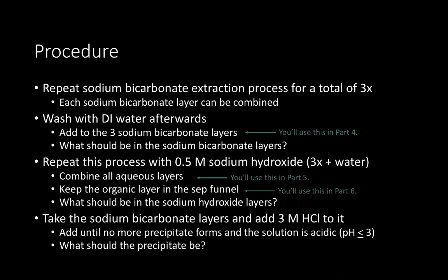At this point, think about what could possibly have been isolated in the sodium bicarbonate extraction. You're going to repeat the extraction process again, this time with 0.5 molar sodium hydroxide. Wash three times with the 0.5 molar sodium hydroxide and one time with water after your sodium hydroxide washes. Each water wash is to remove water-soluble materials like sodium bicarbonate and sodium hydroxide that may have ended up in your organic layers. Combine all aqueous layers from the sodium hydroxide washes — those will be used in part five, and the organic layer stays in the separatory funnel for part six.